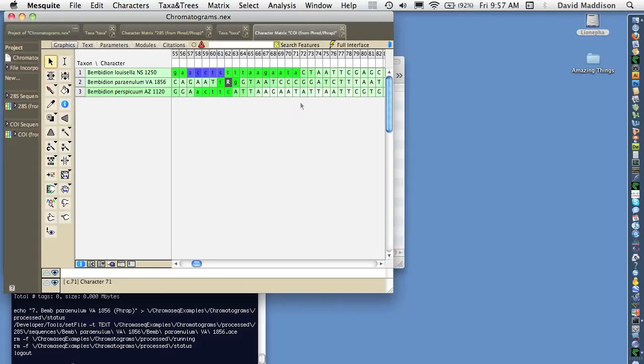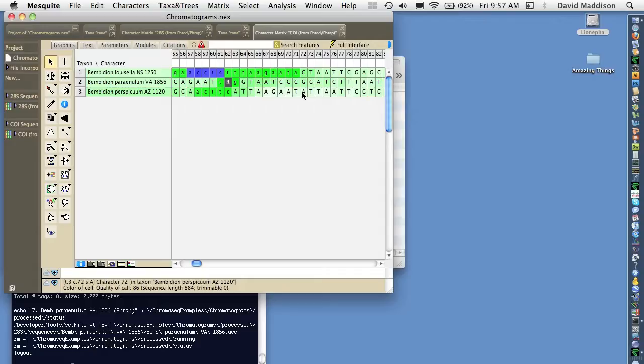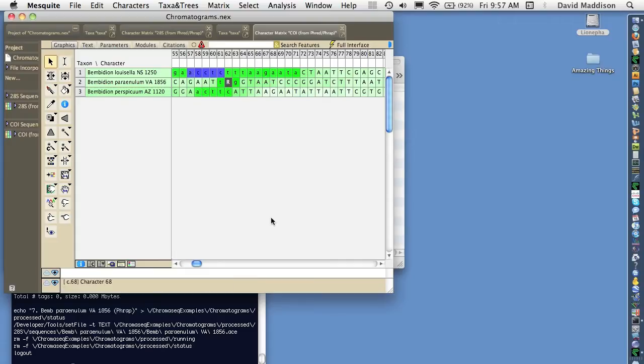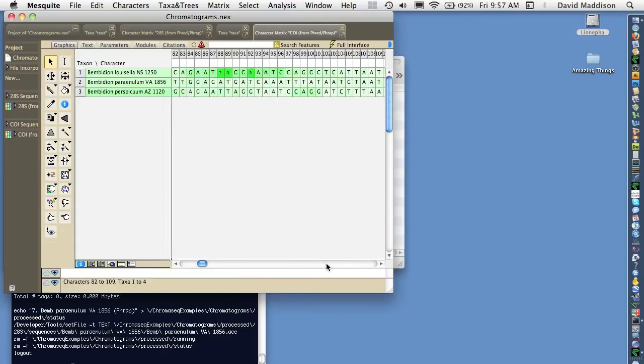And so these paler bases are high quality bases with good strong chromatogram peaks consistent. And the ones that are darker greens and blues are not so good bases.